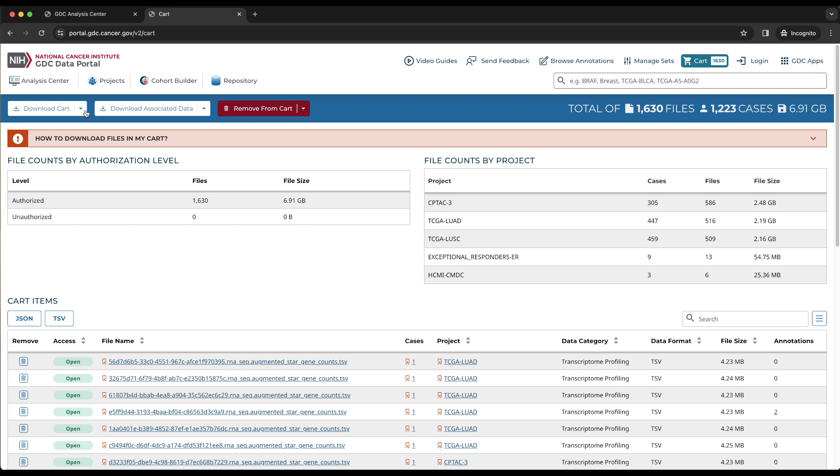The download cart button allows us to download the files in the cart and has two options. Manifest downloads a manifest for the files in the cart. Cart downloads the data files, which are bundled together in a tar.gz file.